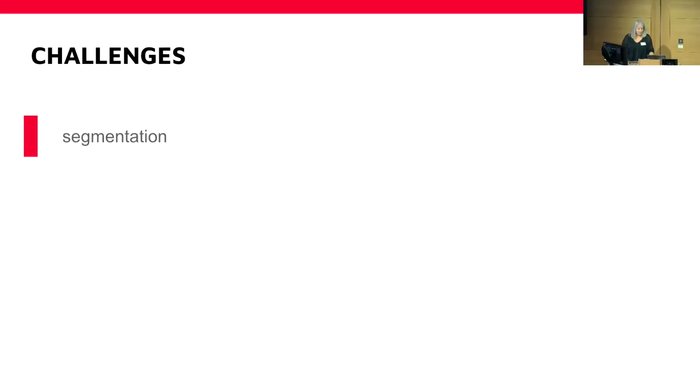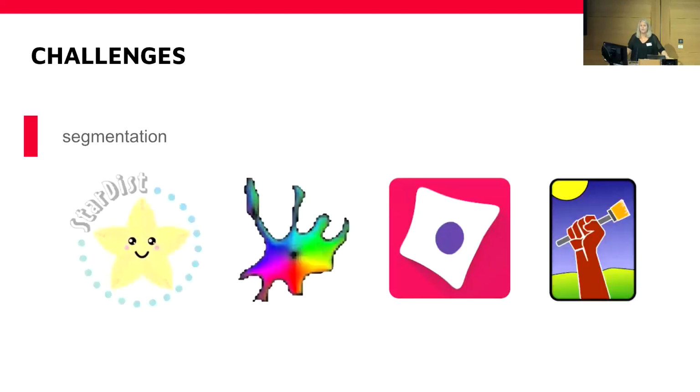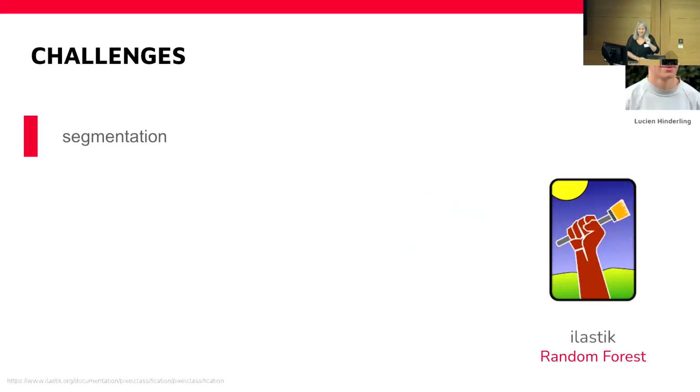So how do we tackle the first problem of segmentation? Well, we have many different tools, and these are only examples. What we allow in napari-morphodynamics is to import any type of segmentation that you have done previously. We also have access to the Cellpose plugin, so you can perform Cellpose analysis directly in morphodynamics, because we don't really want to reinvent the wheel. And do we? Well, maybe a little bit. We want to make it a little better, maybe.